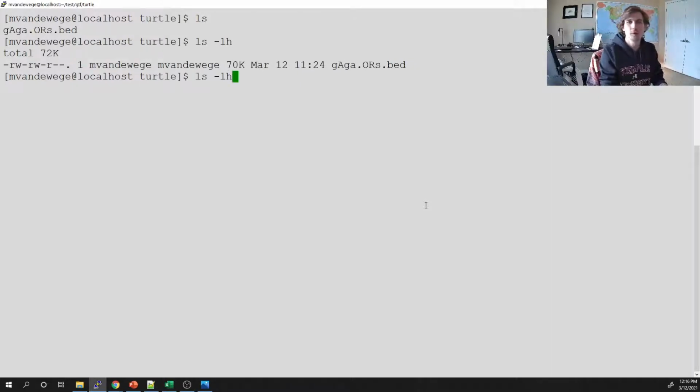Okay. So I want to count. I can take this another step further and count. Right? How many instead of using this unique and just printing out the unique things, I can count out how many times a T was seen or a P was seen or an F was seen, with my -C.